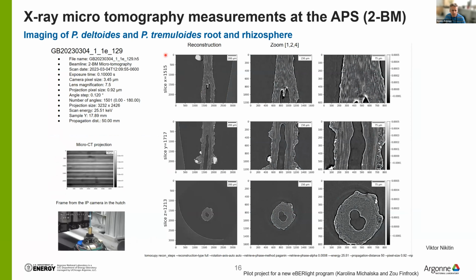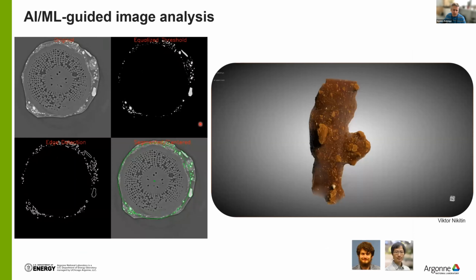What was interesting also is that since we are able to collect root samples again for another run at 2 p.m. in December, while the root samples looked healthy, when we did micro-CT, you can see that the inside was already degraded. So these roots are going through death during the winter season, and new root system is formed at the tips.